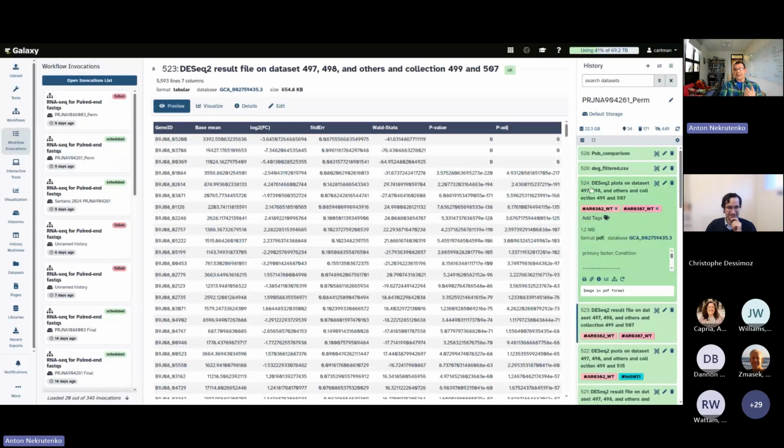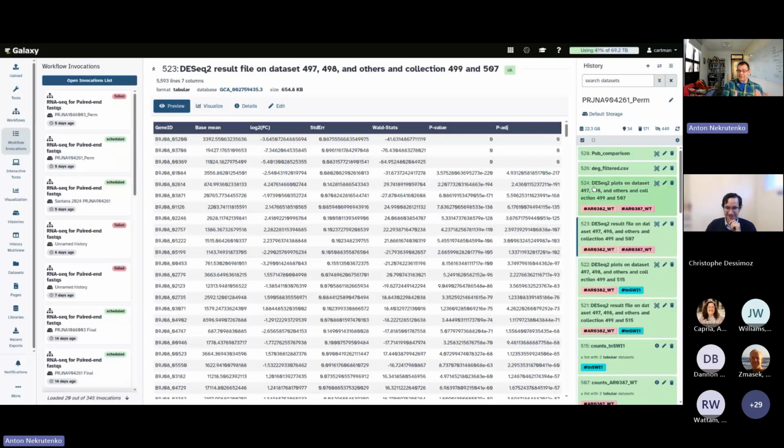And at this point, it depends on what you're doing, on what your experimental design is and what you want to do with this data. In my case, I wanted to compare it with the results of the paper because I wanted to know that what I'm doing is more or less correct. I again employed the same Claude Code idea.